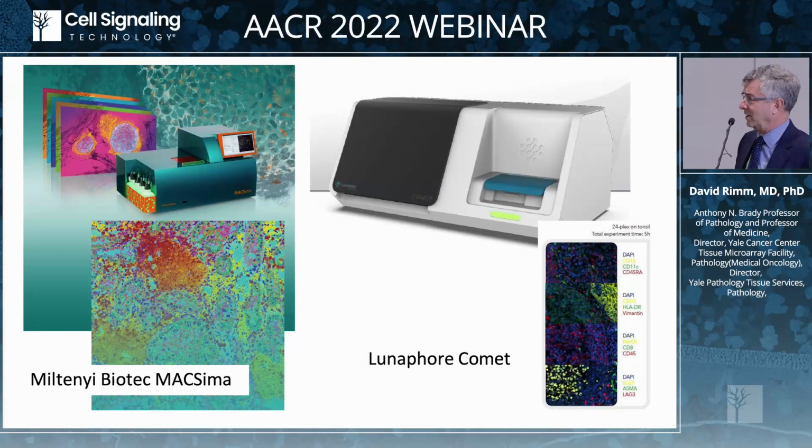And then there's a couple that I don't know much about but have come along, and so I'll just mention their names here: the Miltenyi Biotec MACSima and the Lunaphore COMET.